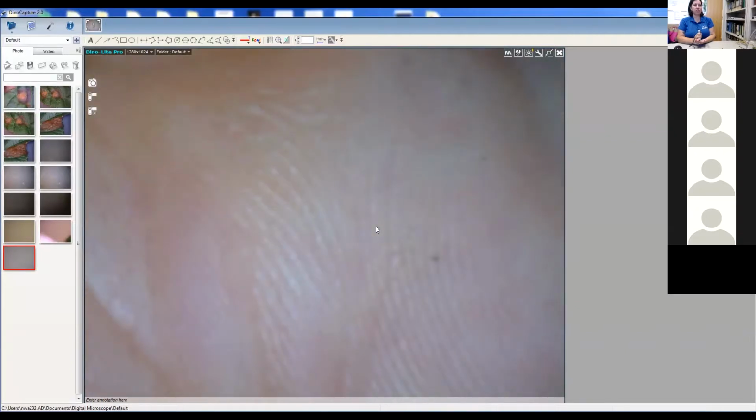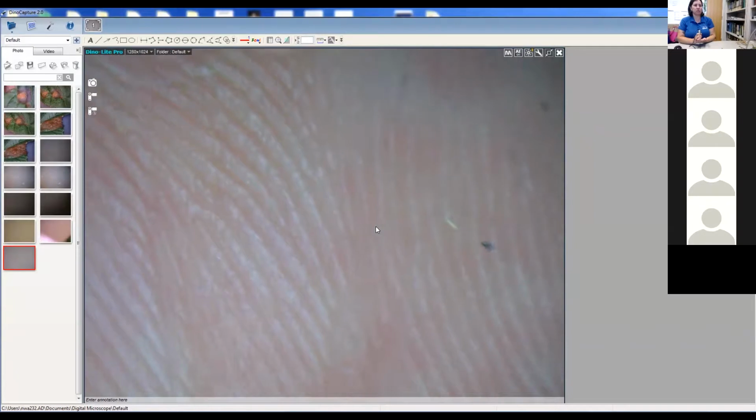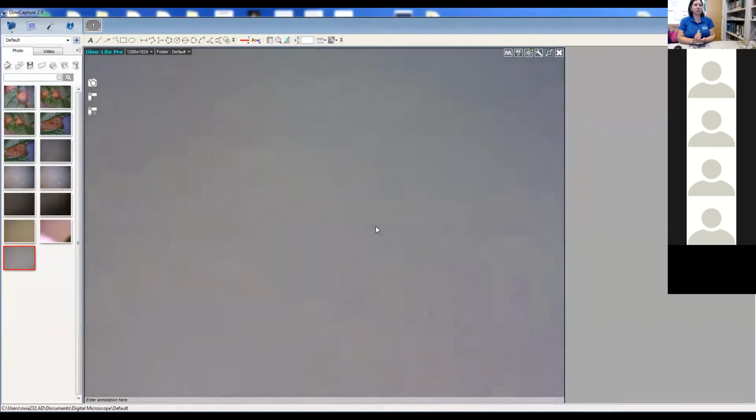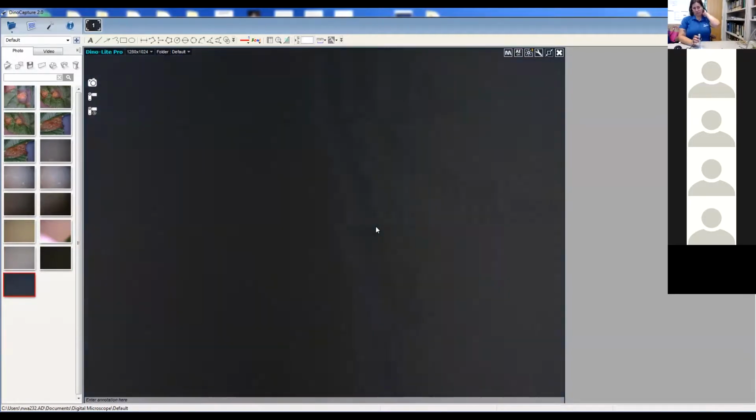So look at the magnification there. Now I'm going to keep going, and you can get a higher plane of focus. So there are two planes of focus in these guys. And these were actually invented for human medicine. So look at that magnification. You can really get a lot of magnification in there if you need to, just holding it very close. You see I keep snapping pictures with the button. Any questions there? I'm going to stop sharing. Any questions?